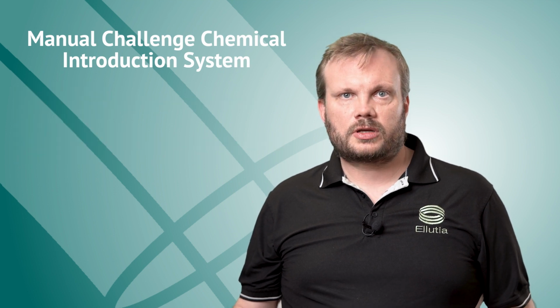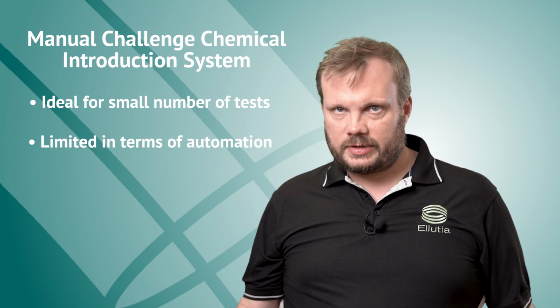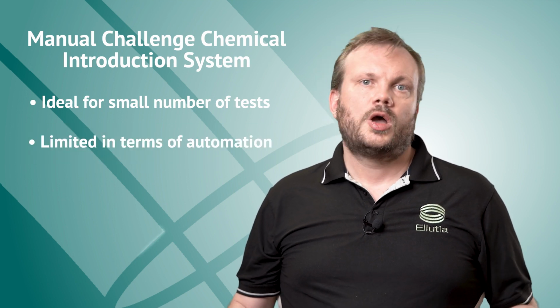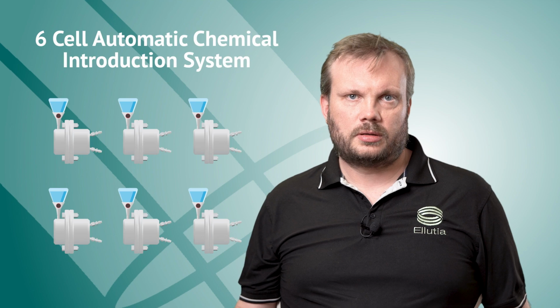Manual challenge chemical introduction is ideal for those running a small number of samples. However, it does have its limits in terms of automation. Which brings us neatly on to the next system configuration, a 6-cell system with automatic challenge chemical introduction.